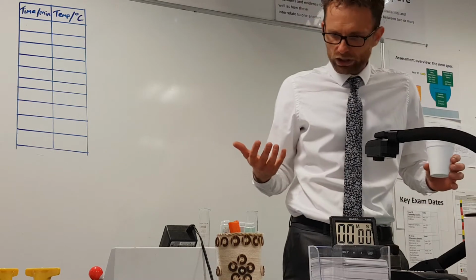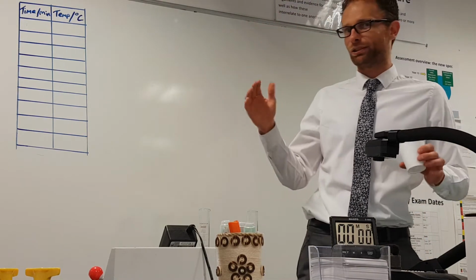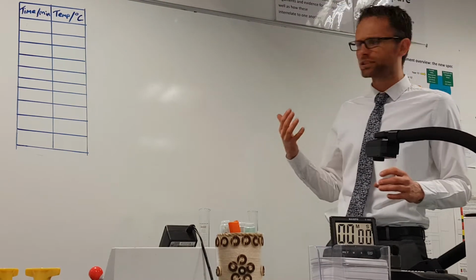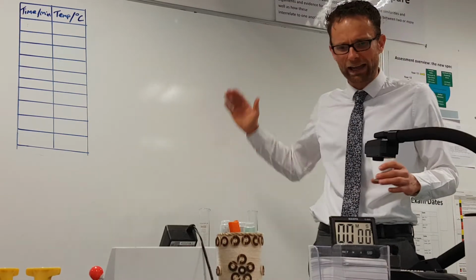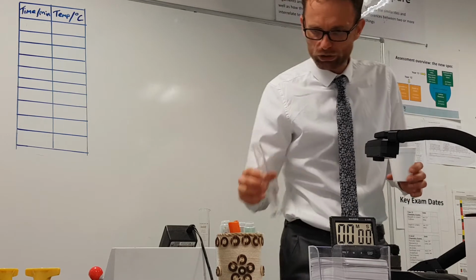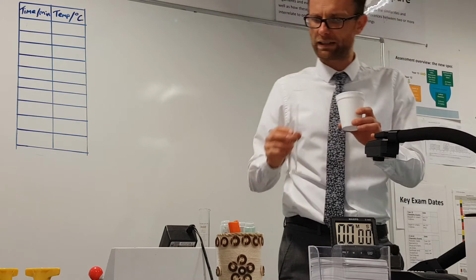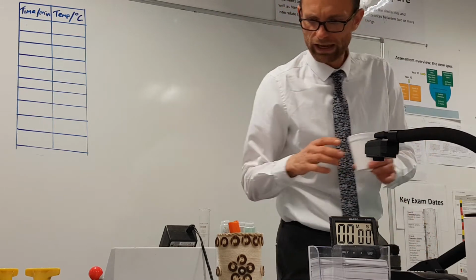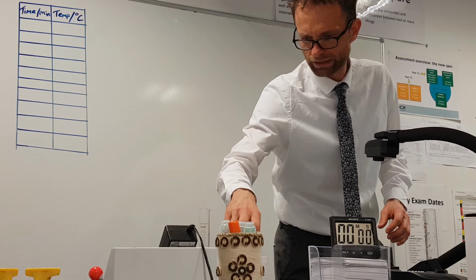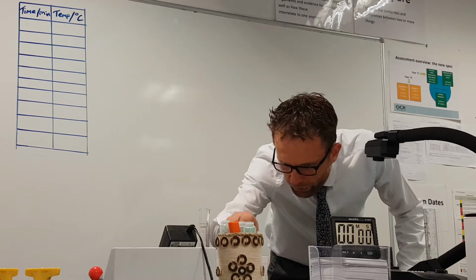of neutralization. So what we're going to do is use a technique called cooling curve extrapolation, which sounds complicated, but it's not really, and it's a very accurate way of determining a quick temperature change. So what you do is you put, I can't remember which one, it's either HCl or NaOH, you put one of them into your beaker first, and you measure the temperature of the solution to the nearest 0.5 degrees.